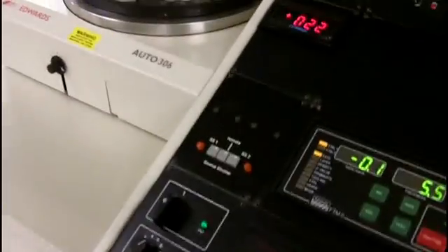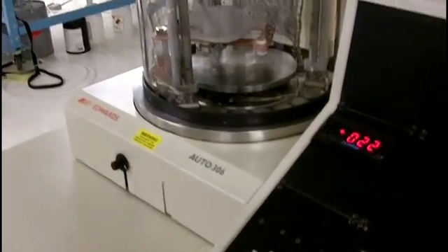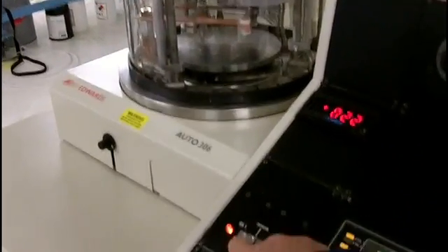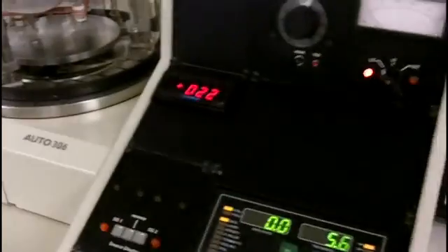I will show you the shutter working by hitting the switch. As you can see the switch is off. Or I can do it remotely.